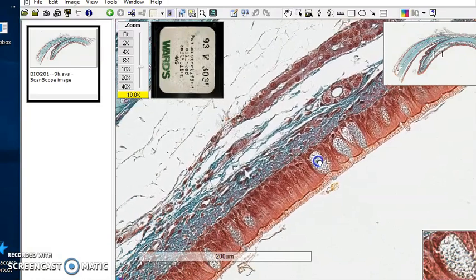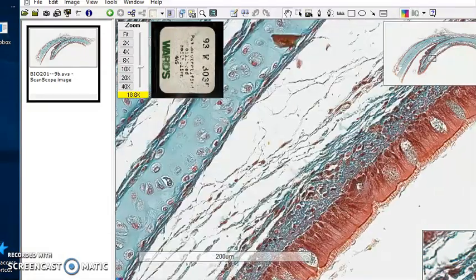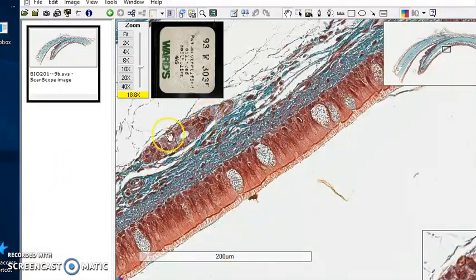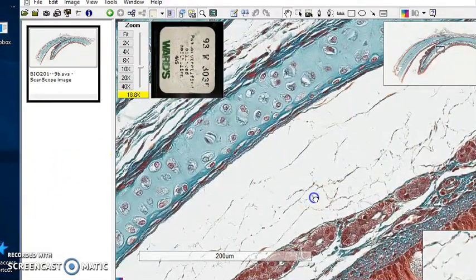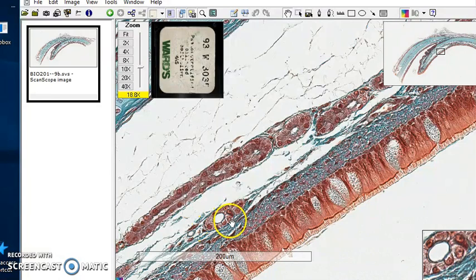What else is here? Down here we see these little tubes made out of cells, and those cells are each about as wide as they are tall. I can hold it still for you. These little bit reddish circles would be the nuclei. And so here's a cell, and here's a cell, and here's a cell. And so that's a very classic looking, simple cuboidal epithelium.